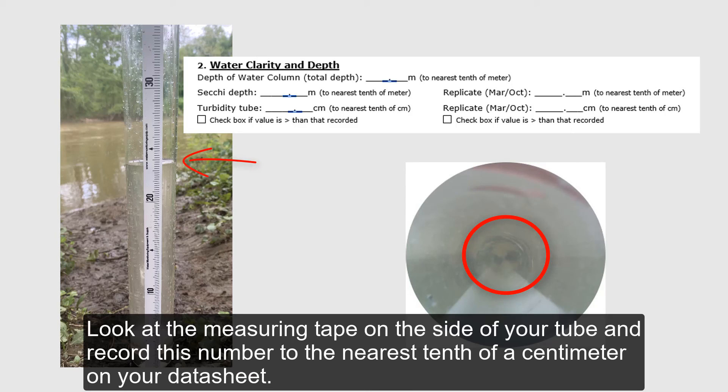Look at the measuring tape on the side of your tube and record this number to the nearest tenth of a centimeter on your datasheet.